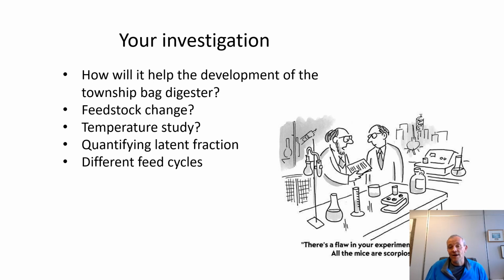We can consider changing feedstock, because obviously we've made up a mixture which we just say represents organic waste from the townships. That's an idea. Maybe you want to play a little bit with temperature. By the way, I've told you, you can record your temperature with your device and get a better idea as to how stable your temperature is in that bag in the lab. Maybe we want to play with temperature.